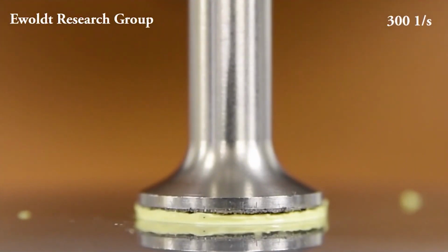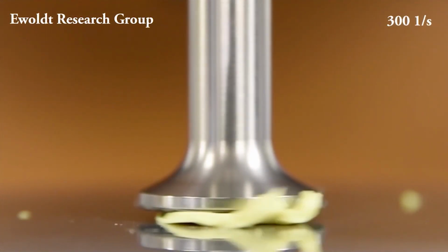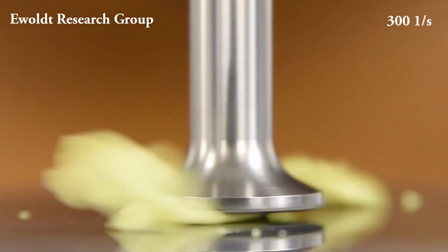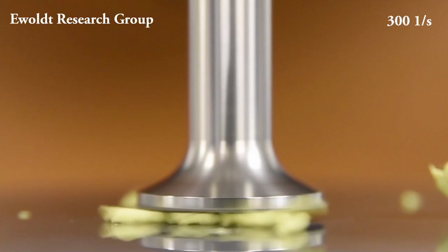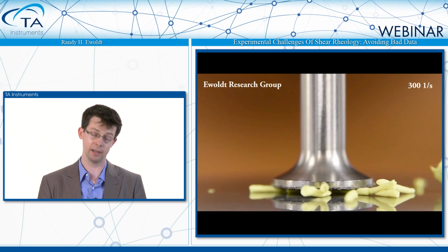And so this is a startup of steady shear at 300 inverse seconds. You see slip, you see edge failure. It looks like a pastry is being made at some point where things are rolling around. That looks like it's going to be shear thinning in the data, but clearly you know that it's not. But again, how would you know?